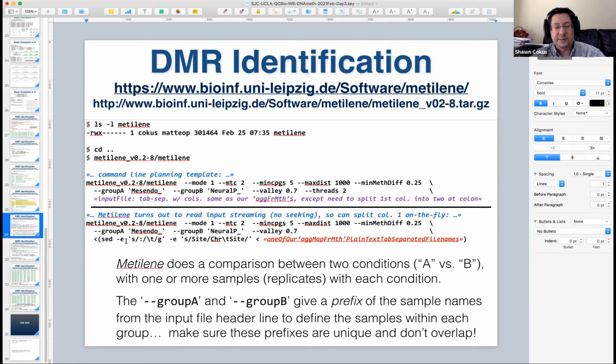And what is this mini pipeline? We're using sed, which is another thing like awk. It is a text stream processor that takes lines of text on input and can transform them through configurable little mini programs that you can fit into command line arguments for simple transformations. It produces output on standard out, with little transformations on the way.